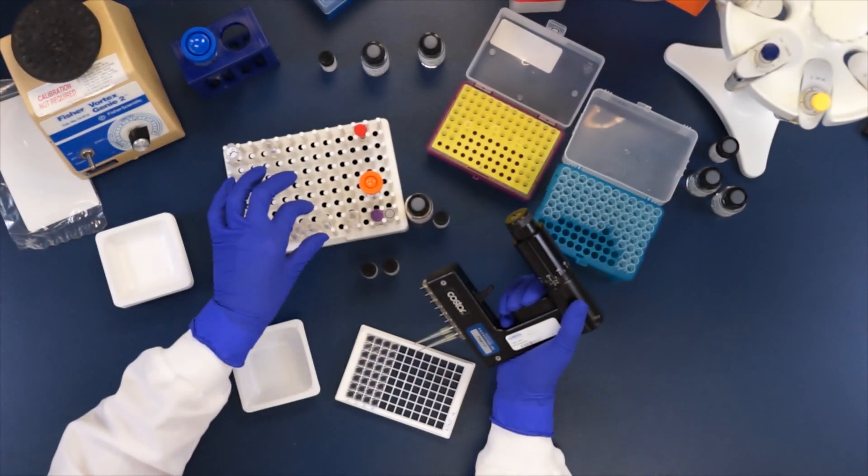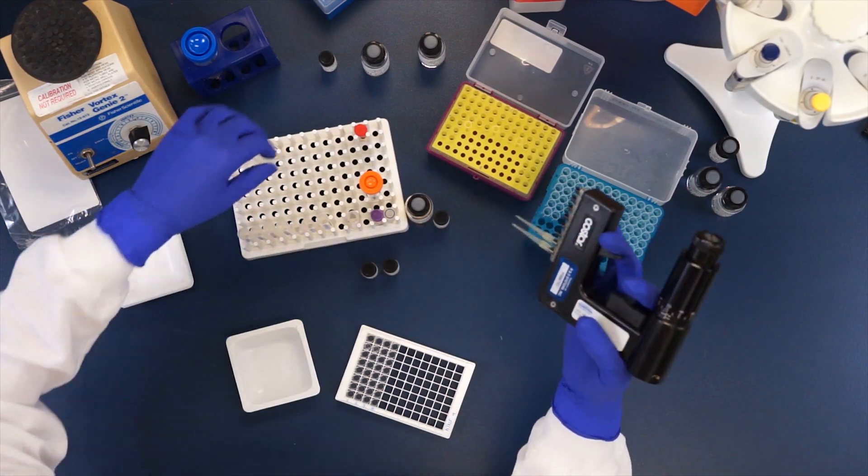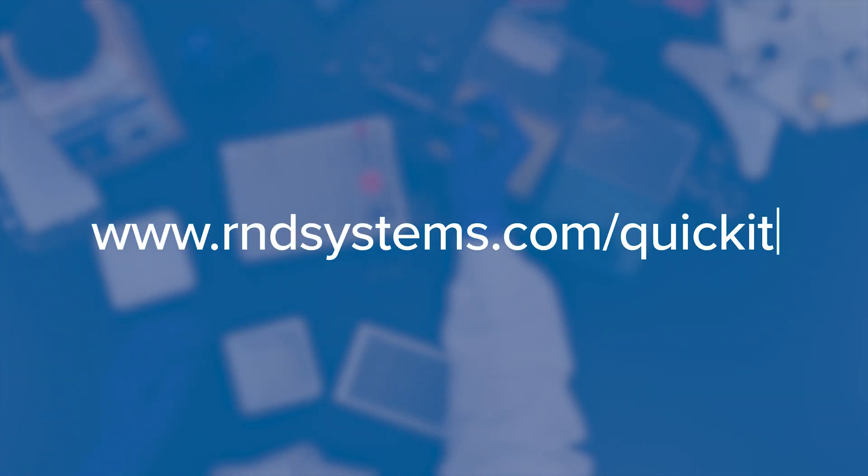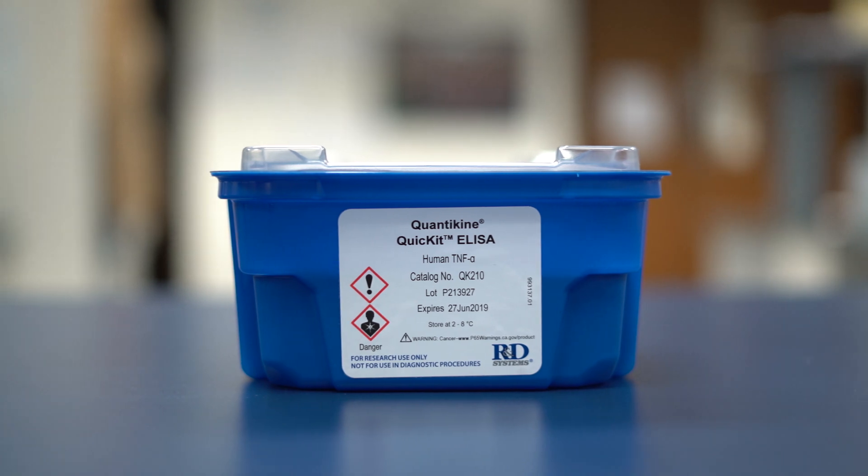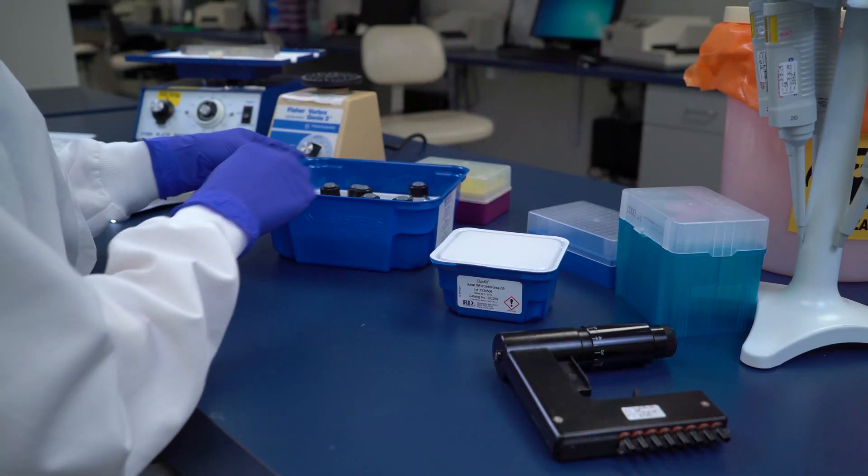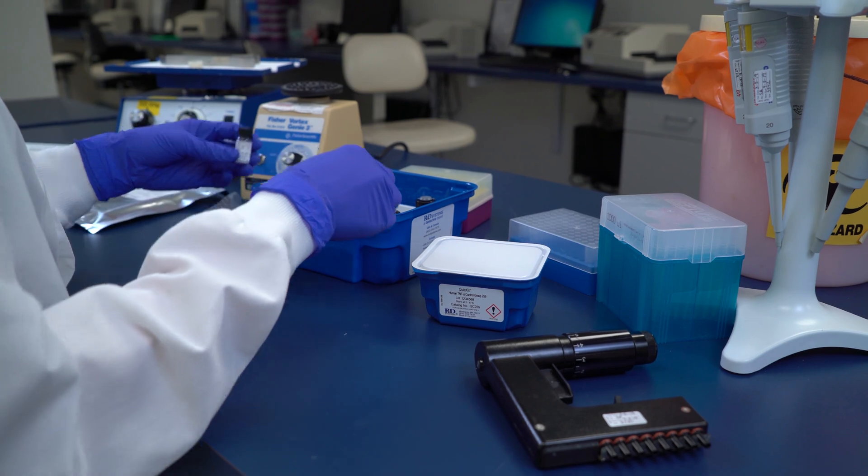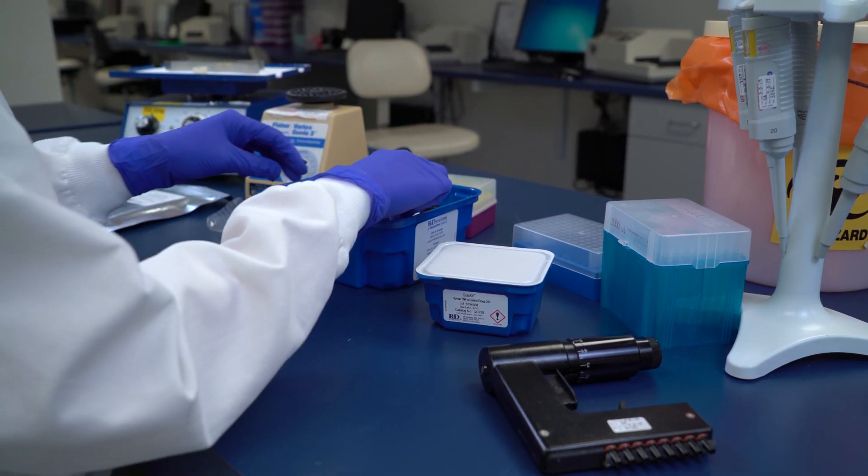QuickKit ELISAs use plates pre-coated with an anti-tag antibody. For more information on QuickKit ELISAs, visit rndsystems.com/quickkit. In this video, we're running a Human TNF-Alpha Quantikine QuickKit ELISA to determine Human TNF-Alpha concentrations in serum and cell culture supernates. This kit is for research use only and not for use in diagnostic procedures.